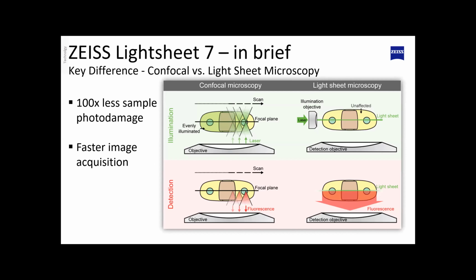So to avoid this, light sheet microscopy, again, now instead of using a coaxial illumination like wide field or confocal, in which the excitation comes through the same objective lens that the detection is being done by, is now illuminating from the side. That's the number one trick.